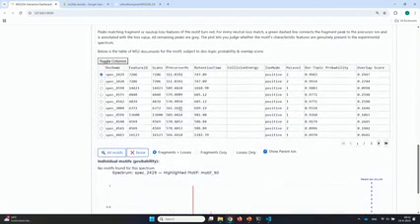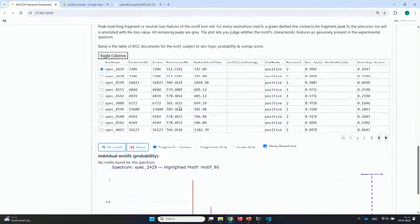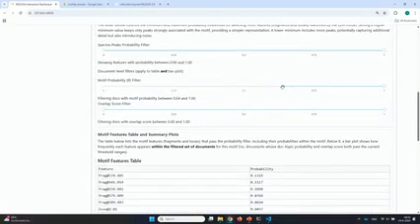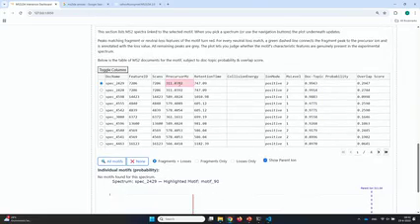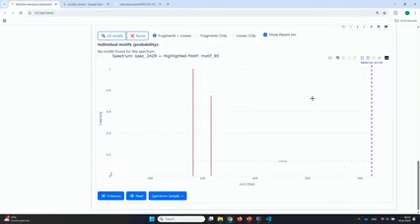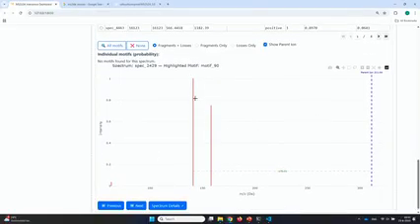Yeah. So then the second task I had in mind was actually that you now have a look. Okay, I have now, let's go back maybe here. Have a look at all the spectra you have as an input, right? And tell me what compounds would you expect. So for example, you have a really, really high topic probability score for the first master motive, for the first spectra for the master motive. If you scroll down, you can see, okay, this master motive has also 2 overlapping fragments, and a loss is also common with the master motive.